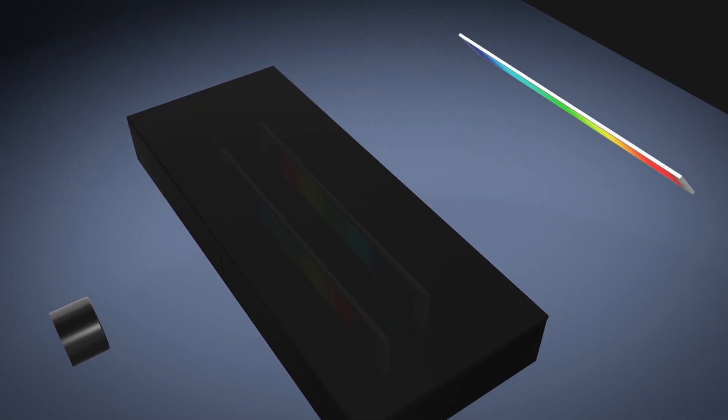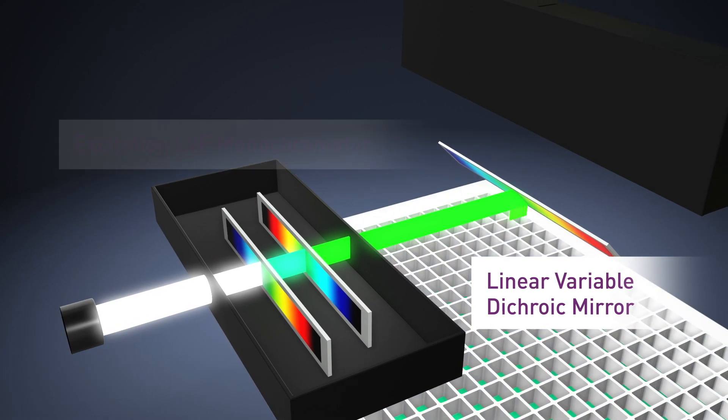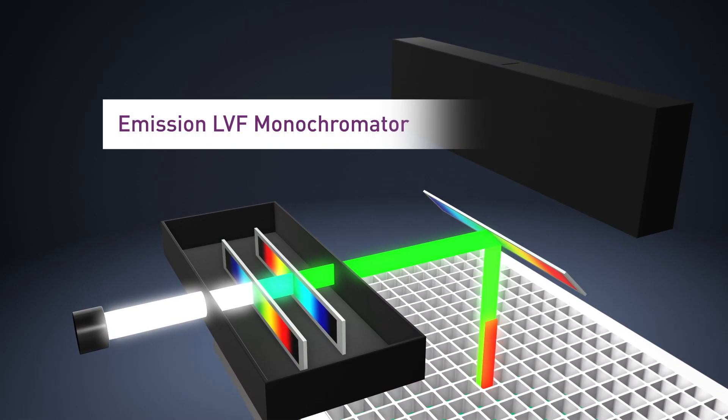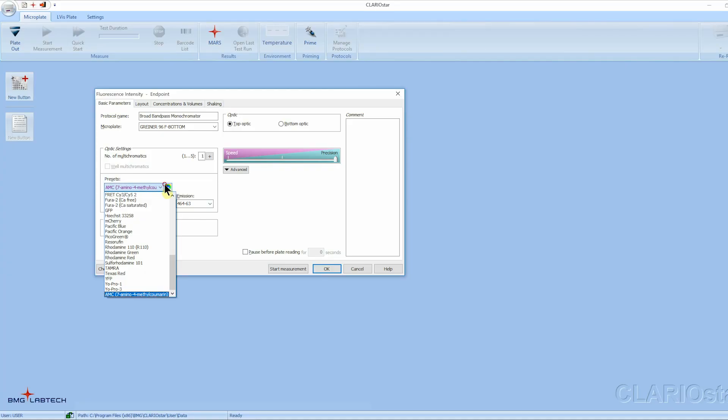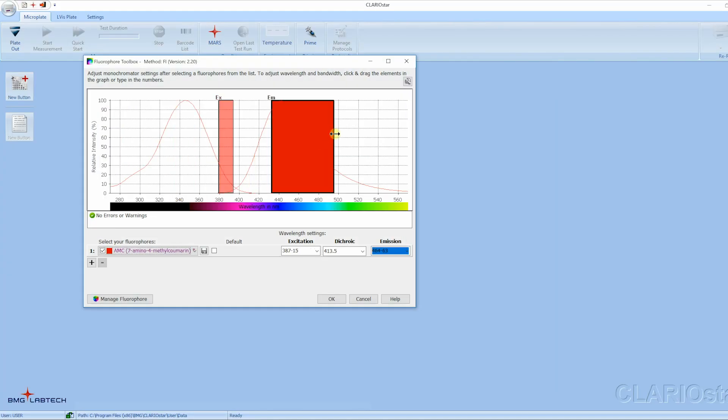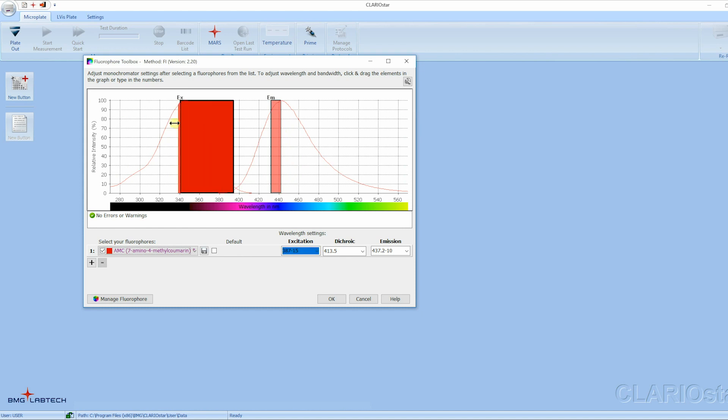The ClarioStar Plus with its patented LVF monochromator and tunable dichroic mirror provides the sensitivity of filters without compromising flexibility. Adjusting the bandpass down to 8 nanometers allows high-resolution spectral scanning, while broadening the bandpass up to 100 nanometers provides increased sensitivity.